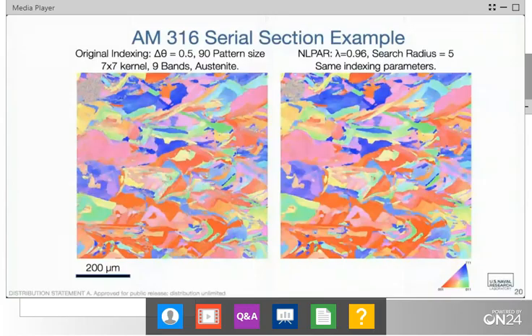Can you consider broad ion beam milling and look to automate that? Yeah, that is certainly something that I considered, and I've looked with great interest into the broad ion beam methods. I think Philip Withers has done quite a bit of that over in the UK. He has started kind of pioneering that method.